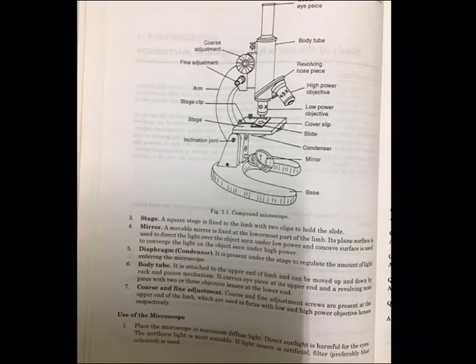And then third is the stage. You are seeing the stage. The stage is fixed to the limb, with two clips to hold the slide. The fourth one is the mirror. A mobile mirror is fixed at the lowermost part of the limb. Its plane surface is used to direct the light over the object seen under low power, and the concave surface is used to converge the light on the object seen under high power.